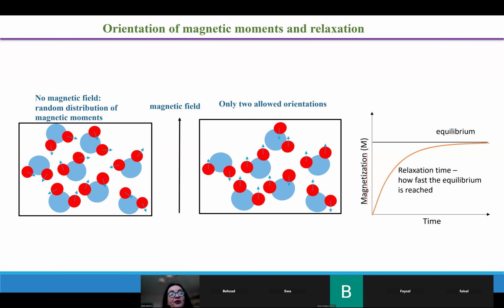There's also a lot of other molecules in the world which include hydrogen atoms. So let us forget about water. Let us focus at this moment on hydrogen. Then I'm risking that you will think that actually to perform NMR, one necessarily must have hydrogen in your sample, and this is also not true. However, let us stick for today to hydrogen. So, in fact, you have a lot of hydrogen atoms in your box. The hydrogen atoms belong to water molecules, but they must always belong to something.